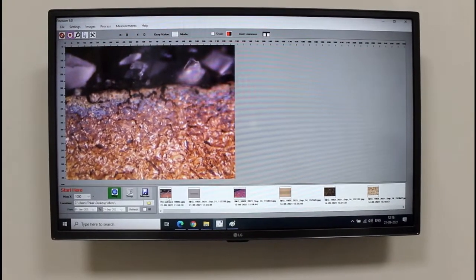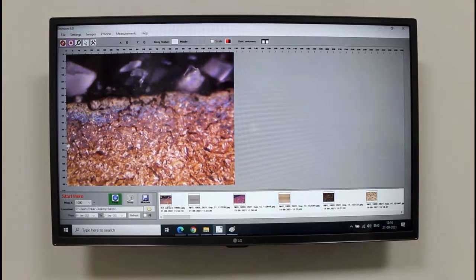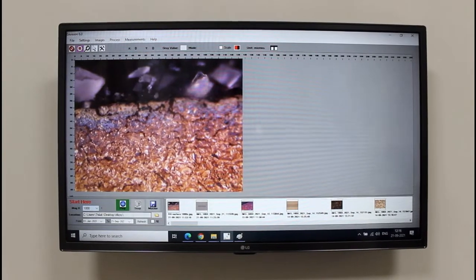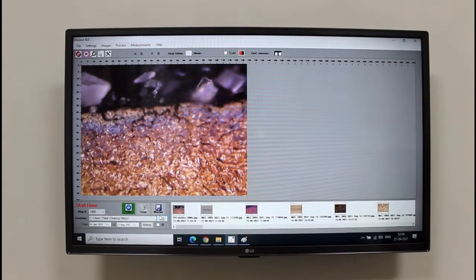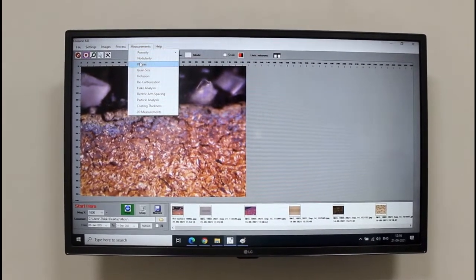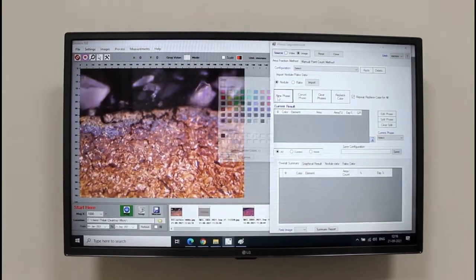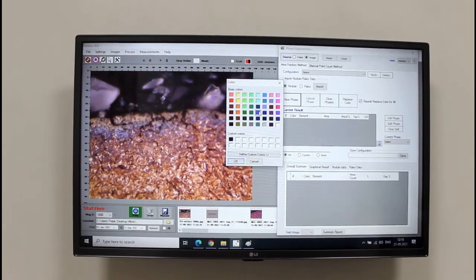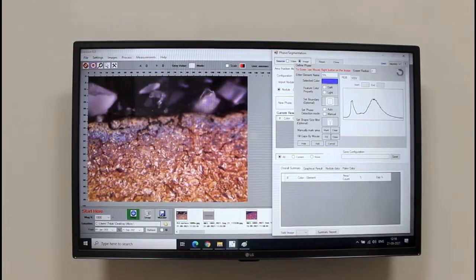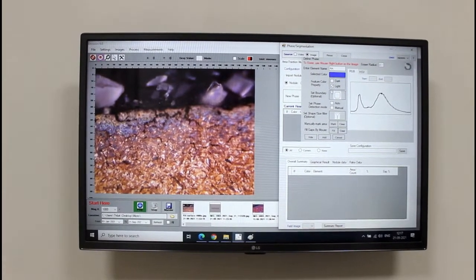In this microstructure, we can see retained austenite which is in white color, and this is captured at 1000x. So I am giving a magnification as 1000x. Now we are going to calculate the percentage of retained austenite in this microstructure using this software. Using the same phase analysis, click new phase and I am assuming a color for it. Click OK. Since the RA is in white color, we have to click light and enter the name as RA. Click auto.